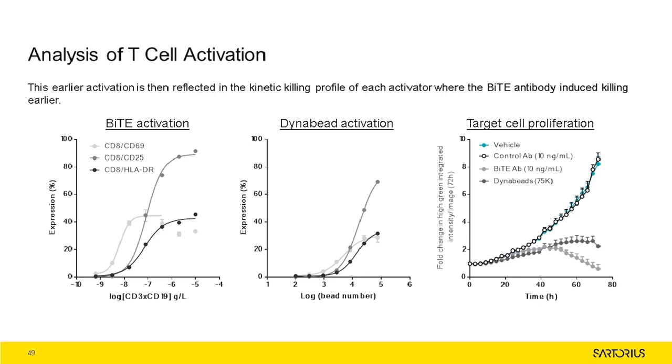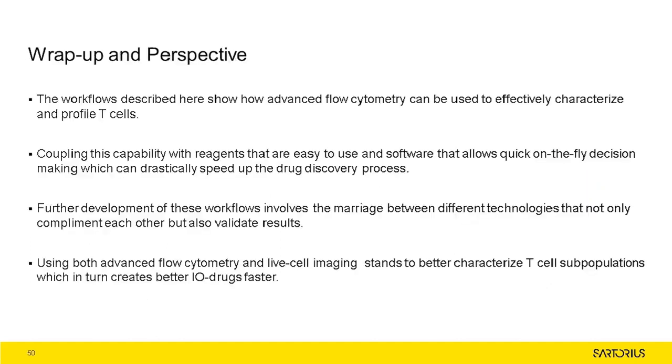The light grey time course shows the BiTE point of inflection at approximately 50 hours, whereas the Dynabead, shown in the dark grey, only begins to show a decrease in target cells at the last time point, again suggesting that the T-cell activation has progressed at a faster rate. The data supports that BiTE activation not only effectively activates T-cells, it can kill more effectively and faster than the more crude activation from Dynabeads, without producing excessive amounts of cytokine. When designing therapeutic drugs, being able to detect for such attributes is an important ability, and having the tools to carry this out effectively even more so.